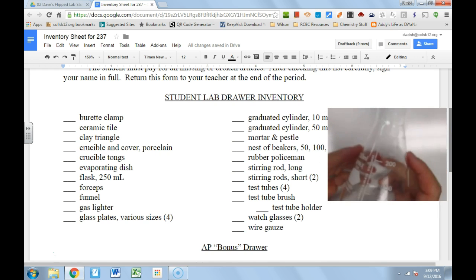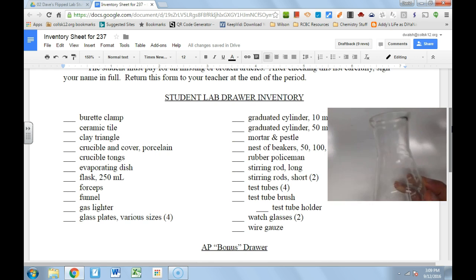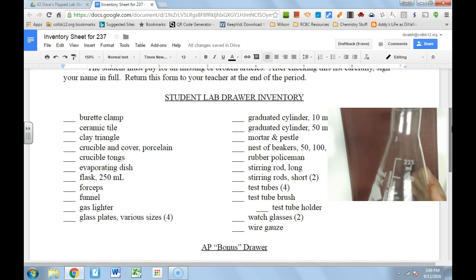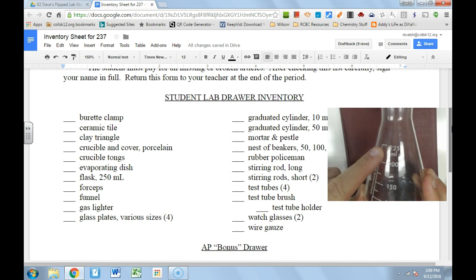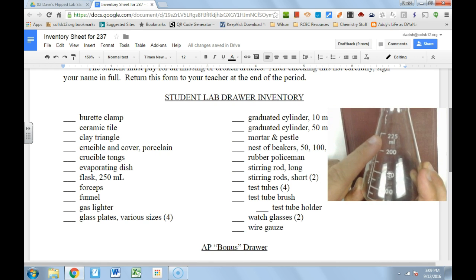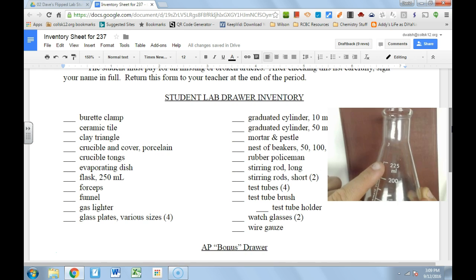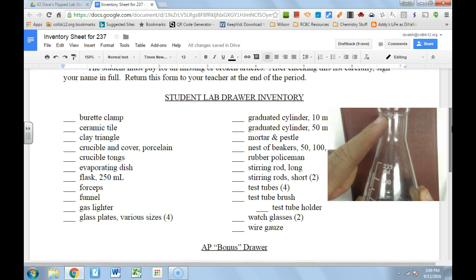This is an Erlenmeyer flask. There are several types of flask, but this is the Erlenmeyer flask. On the flask you'll see graduations — this is a 250 ml flask but it's only labeled up to 225. The other 25 ml is there for things above and beyond. So it's a 250 ml flask but the markings only go up to 225 milliliters.